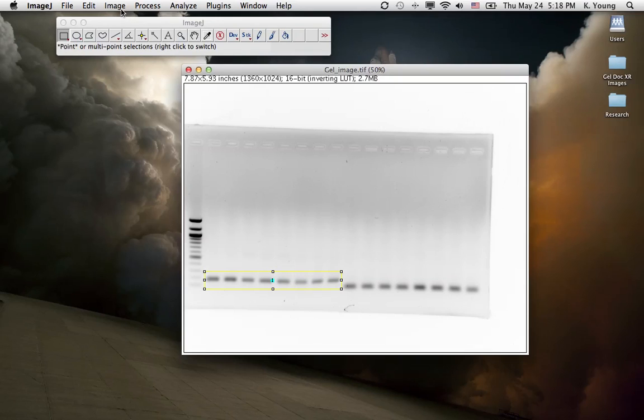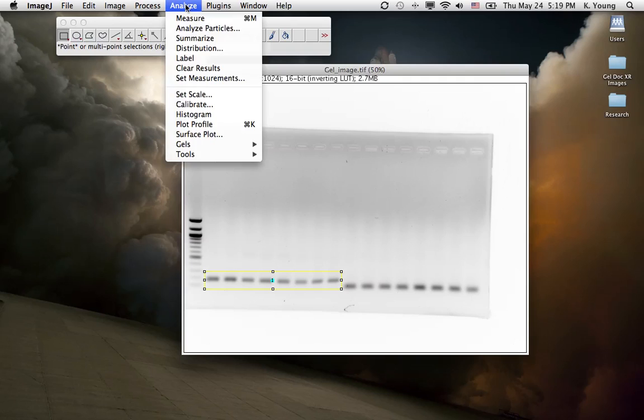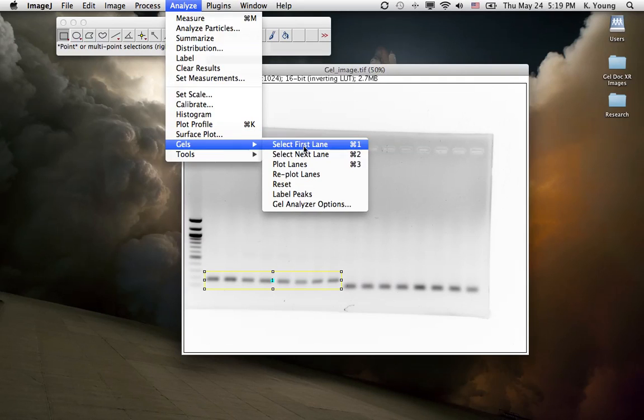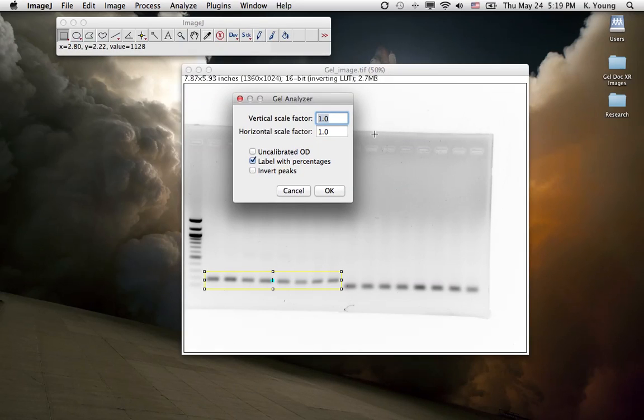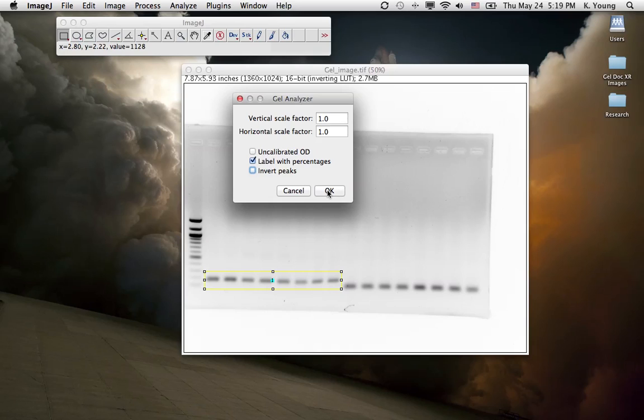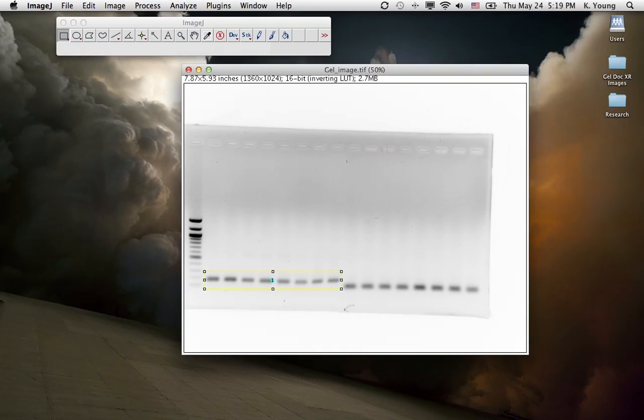Next thing we want to do is go to Analyze, go to Gels, and then go to Gel Analyzer Options. You have to make sure this box is unchecked, Invert Peaks. These values here are default. Just leave them alone. Everything else, leave them alone. Click OK.